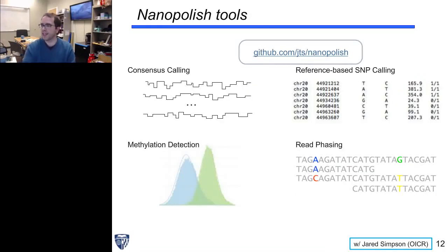So taking a slight step to the side, typical short read sequencing is very accurate. It's 99.9% accurate on a single base level. Nanopore sequencing, as you may have heard, is not necessarily that accurate. The raw accuracy of base call data probably rests around 90%, 92%, depending on how you look at it, the quality of the DNA you're putting in, etc.